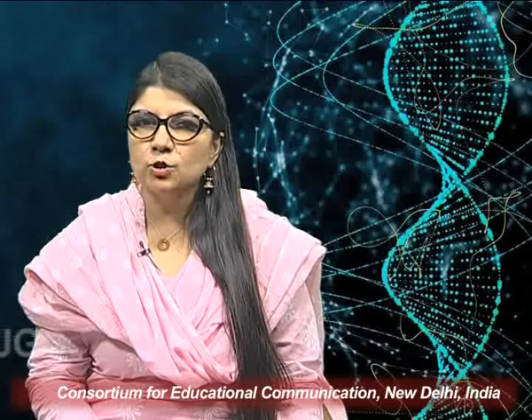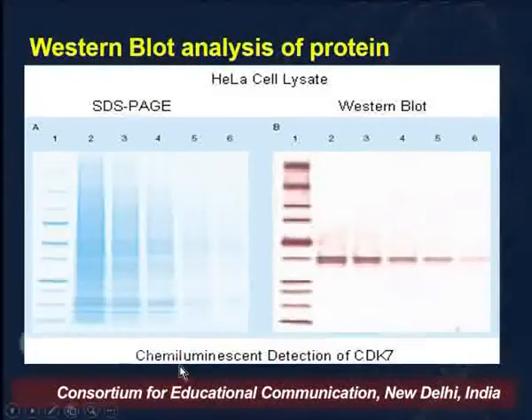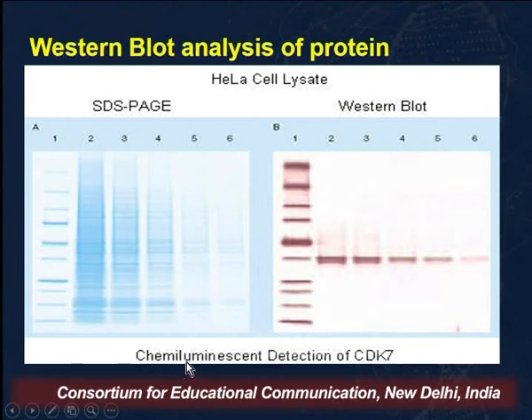Isolation of these biomolecules is different. So we isolate the biomolecules and we run them on different gels. For example, in the case of protein, we run it on an SDS-PAGE gel. For DNA and RNA, we run it on agarose gels. We blot it onto the membrane. Again, this blotting can be simple capillary action or it can be an electroblotting method.